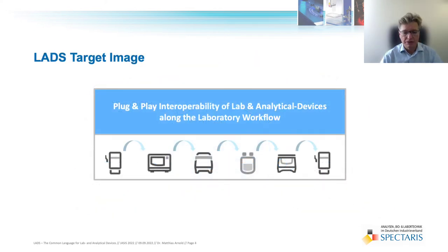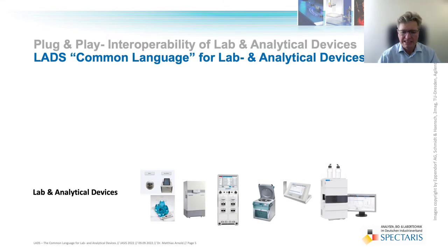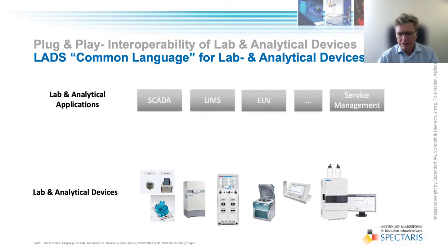What are we trying to achieve? We aim for true plug-and-play integration of lab and analytical devices along the laboratory workflow. Seamless connectivity of devices with an absolute minimum of configuration necessary, if any at all. We are all aware that such connectivity is hard to achieve in our domain. It is hard to establish plug-and-play interoperability between the many different lab and analytical devices on one side, and all the different applications like SCADA, LIMS, ELN, data asset or service management on the other side.